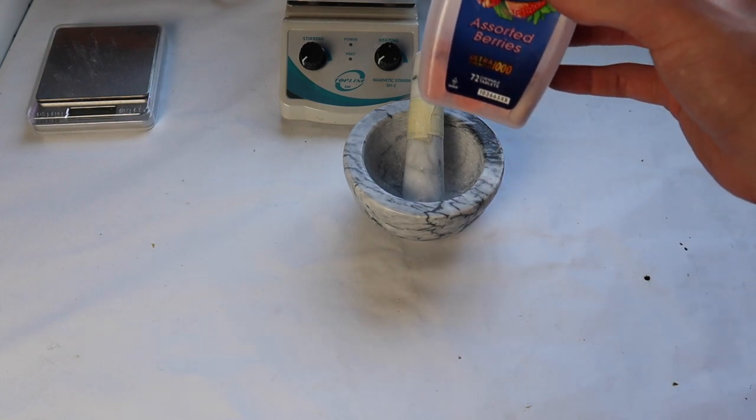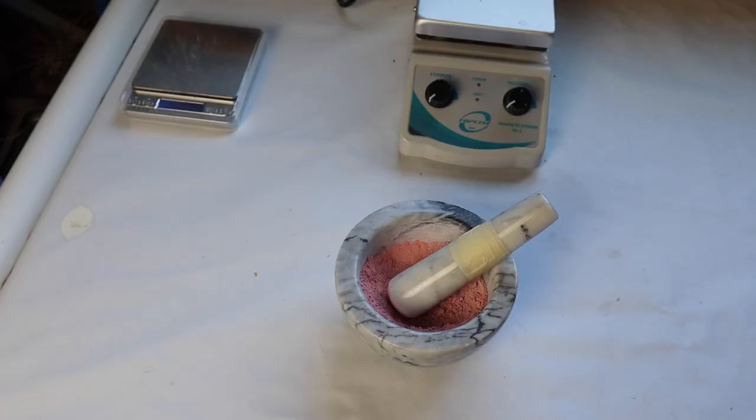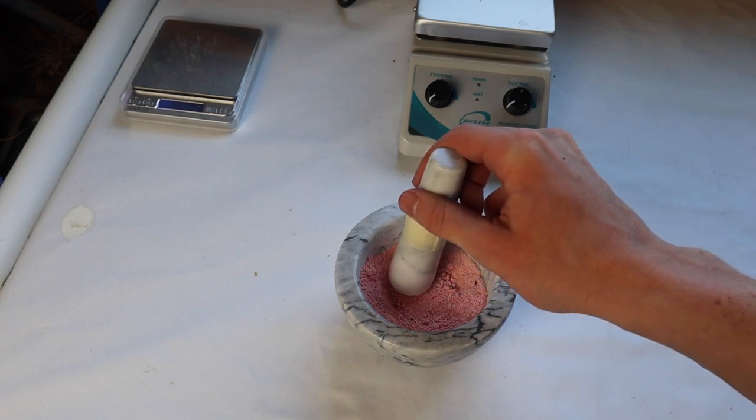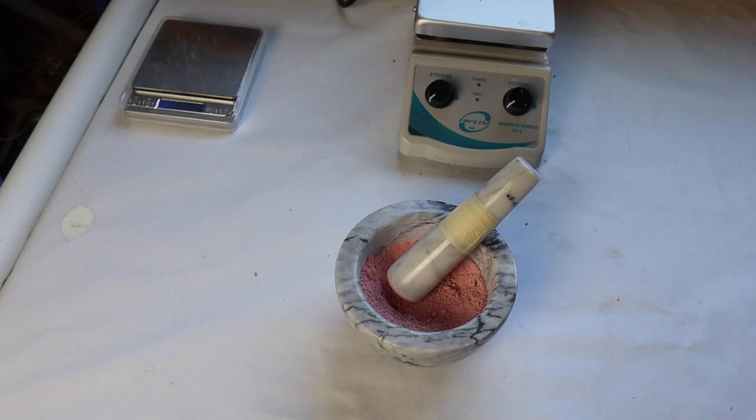The first step is just going to be to crush up the Tums in a mortar and pestle. Each one of the Tum tablets weighs about 2.6 grams and has about 1 gram of calcium carbonate. So what I need to do is get rid of the 1.6 grams that is not calcium carbonate.